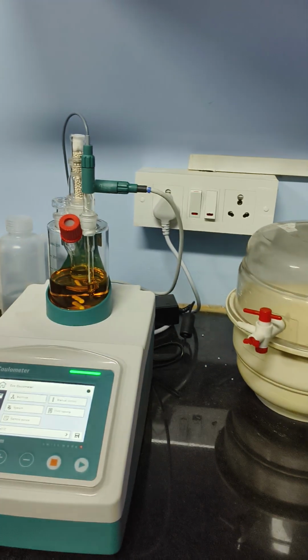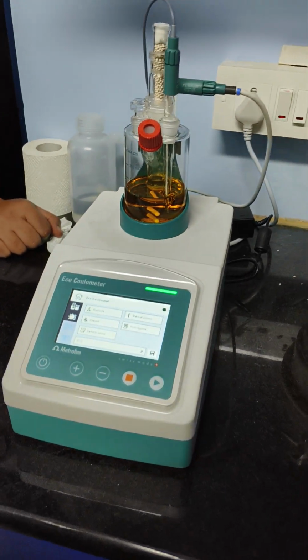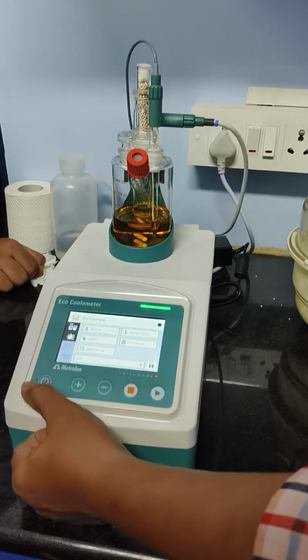So what you have to do initially, when you want to start the analysis, is here you have a different button. Madam, help me to switch on the machine. This is the power button.